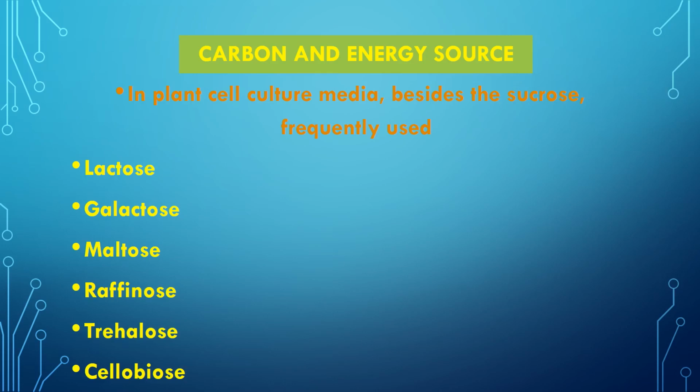The best way to use sucrose in the medium is to add the sugar to the prepared mixture of the medium and then autoclave it. This causes the hydrolysis of the sucrose to its component sugars, glucose and fructose, which seems to be a very ideal source for that particular medium.